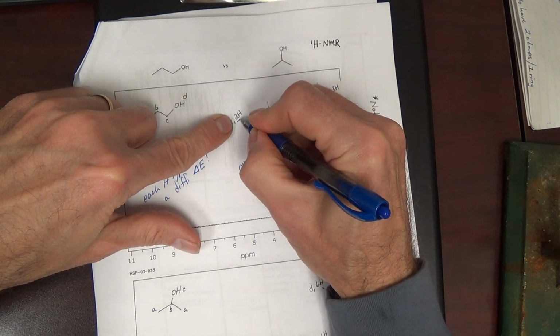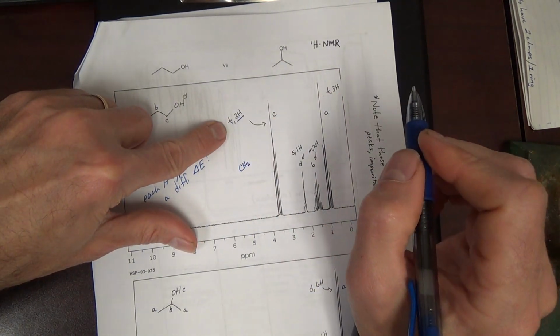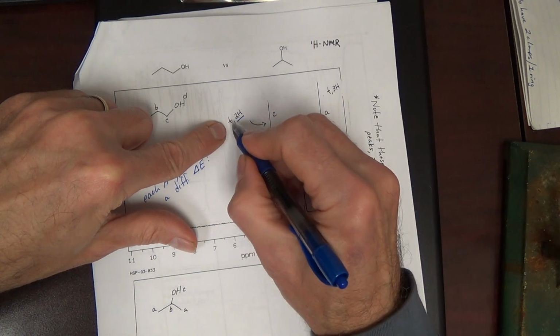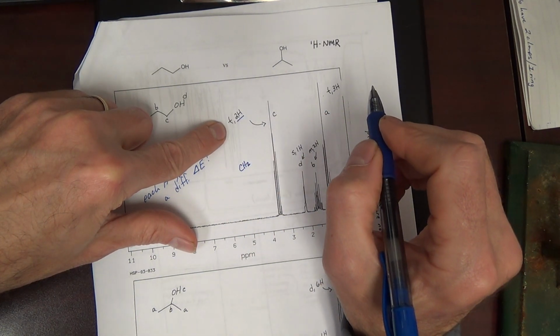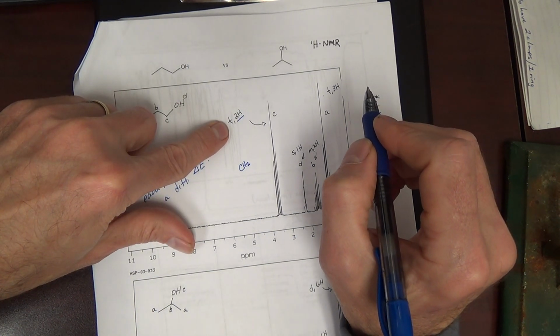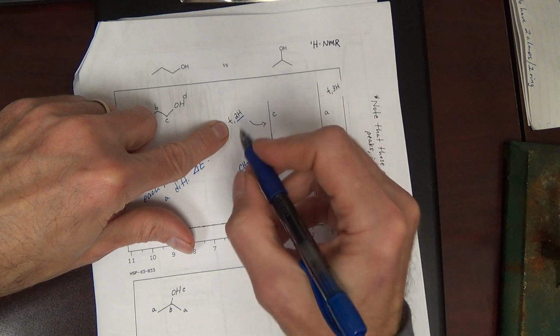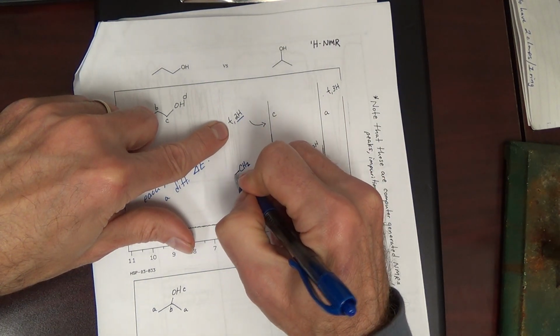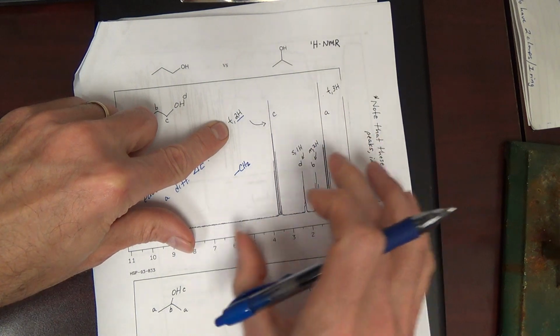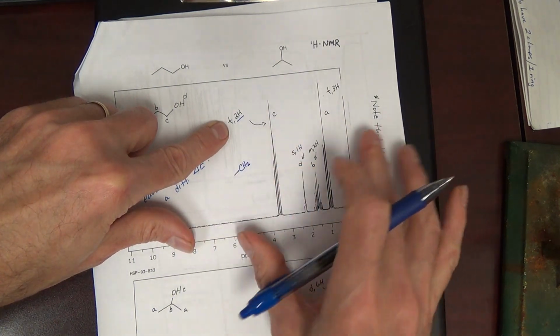That's the integration. What does the triplet part tell you? Very importantly, it tells you about the neighbors. How many neighbors does this CH2 have? Now again, we're assuming it's CHs here, hydrocarbon.